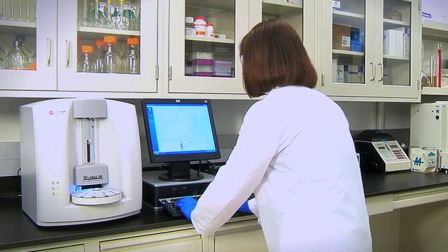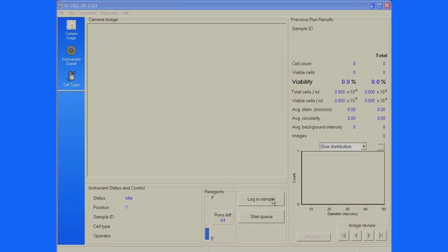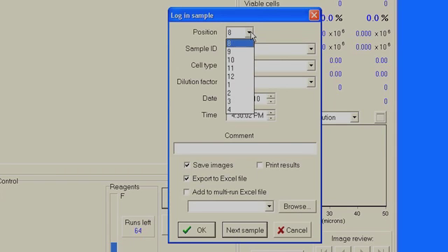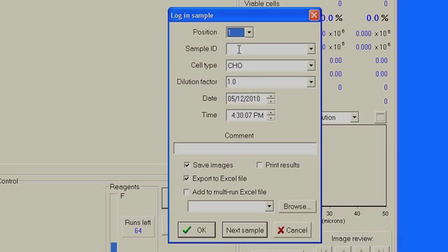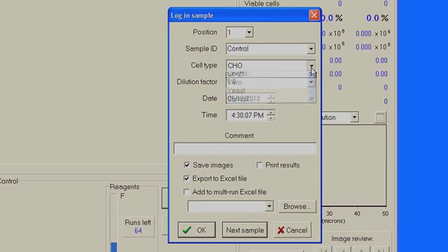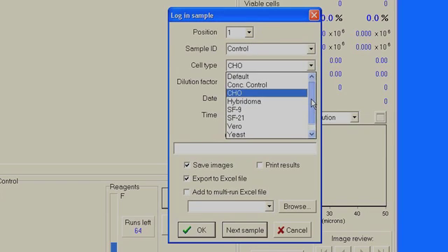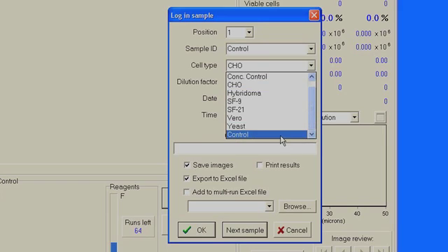Simply log in the sample information by clicking the log in sample button. Select any available sample cup position on the carousel and enter in the sample ID. Select a cell type from the ViCell built-in cell library. The cell types feature in the software allows you to optimize sample preparation and analysis for your specific cell line.